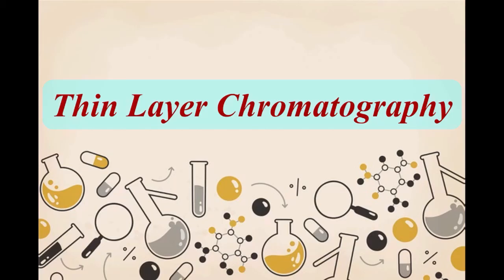Thin layer chromatography or TLC is a chromatography technique used to separate non-volatile mixtures. Thin layer chromatography is performed on a sheet of glass, plastic or aluminum foil, which is coated with a thin layer of adsorbent material, usually silica gel, aluminum oxide or cellulose.